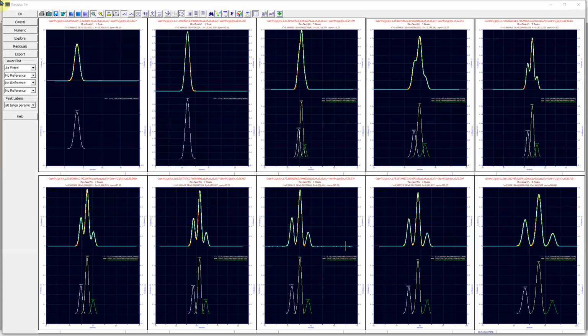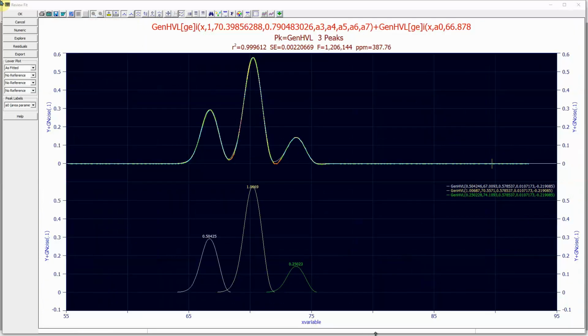This is a good point to mention that since deconvolution is area invariant, the fact that we over deconvolve the actual IRF on these higher column length simulations doesn't mean that you're suffering in any way because of the area computations. If you're purely looking at the individual quantities, you see here we have 1.00, 0.504, 0.250 on the 80. The areas are beautifully recovered.